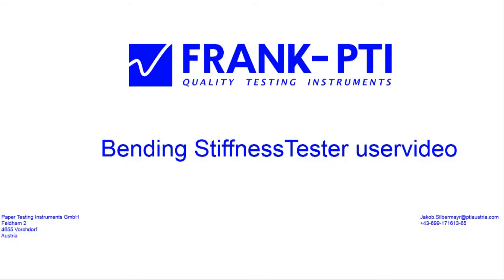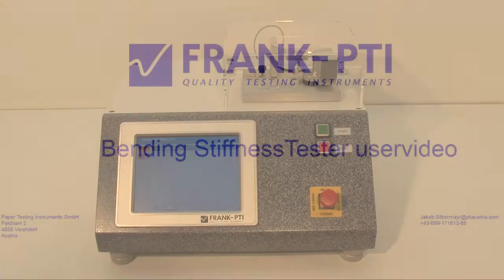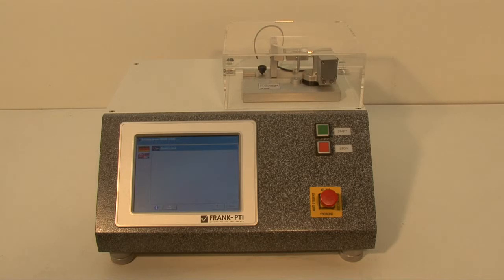Hello ladies and gentlemen, this is Jakob Silbermayer from Paper Testing Instruments Austria. In the following video I will show you how to use this bending stiffness tester from Frank PTI.